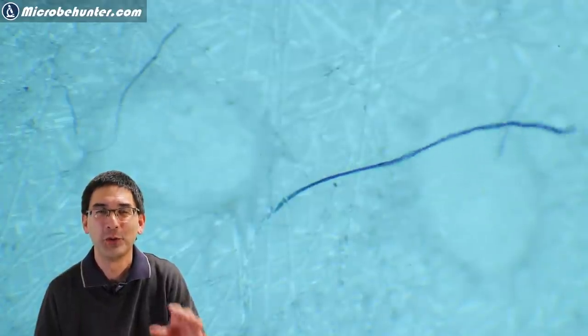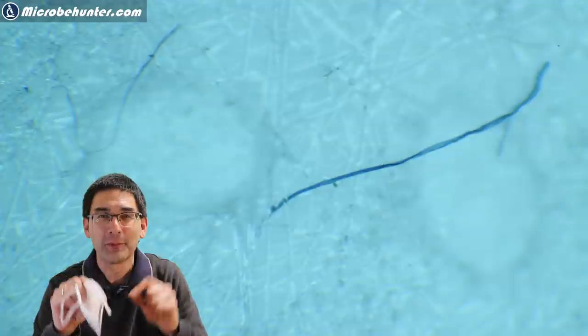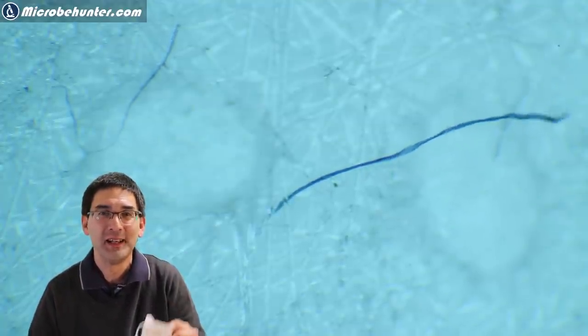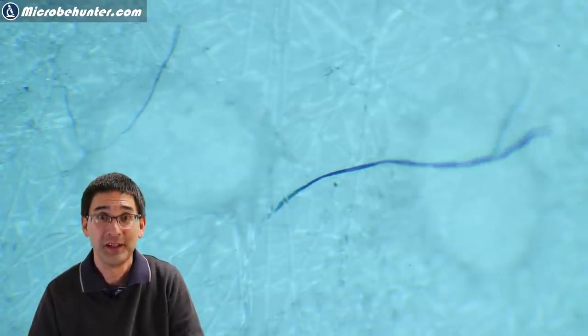Hi, Microbe Hunter here and those strange moving fibers that you see, well I found them here on this very face mask and those fibers they almost look like they're worms.